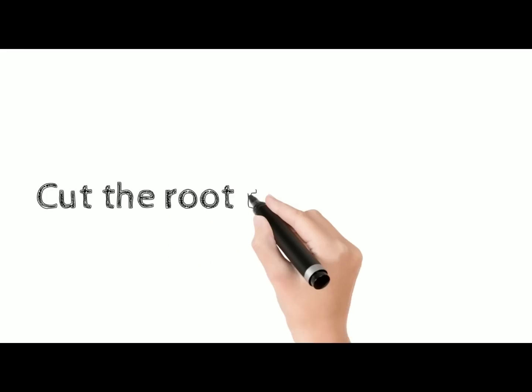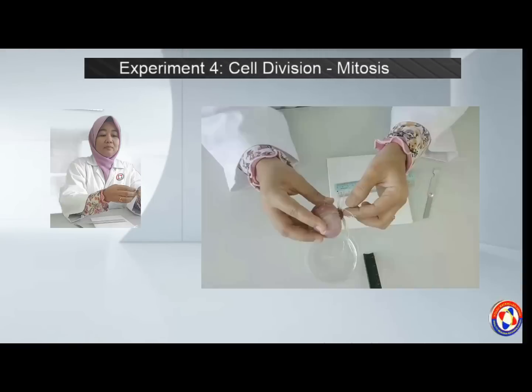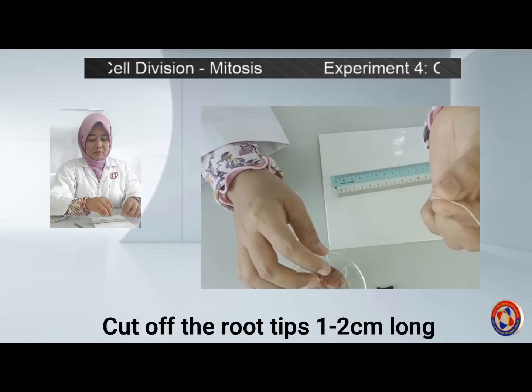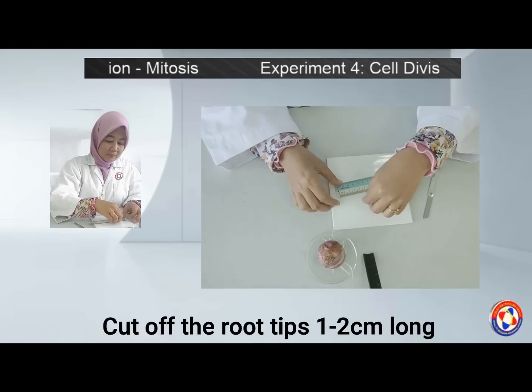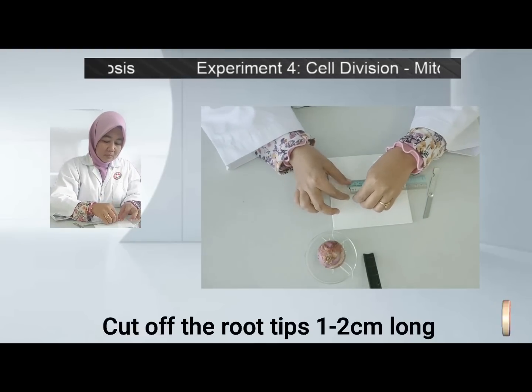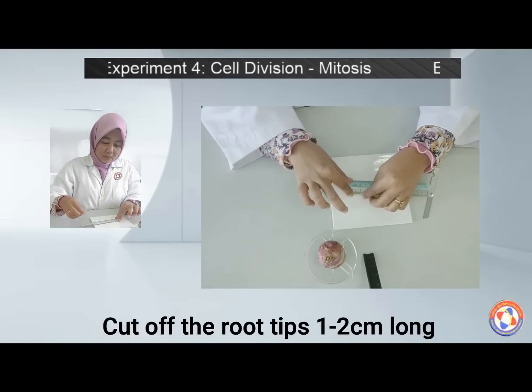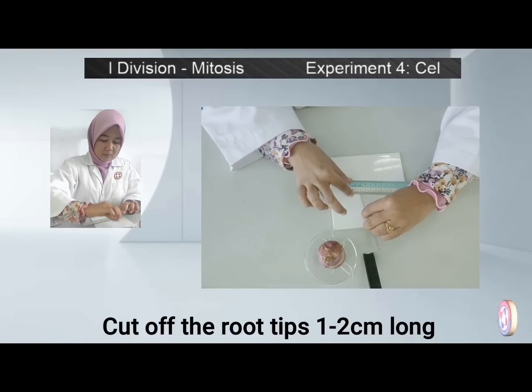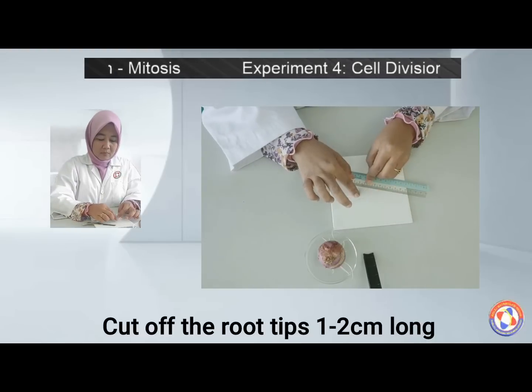First, cut off the root tip 1–2 cm long. Make sure you choose the root with the growing tips, and make sure the root tissue is fresh.